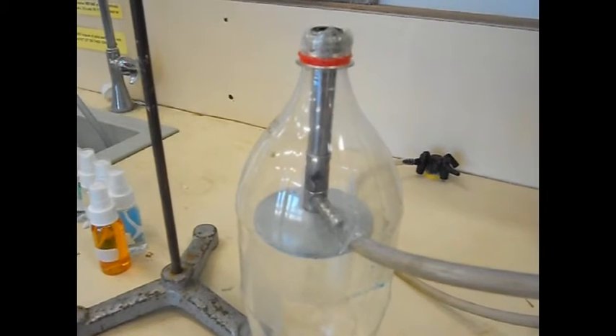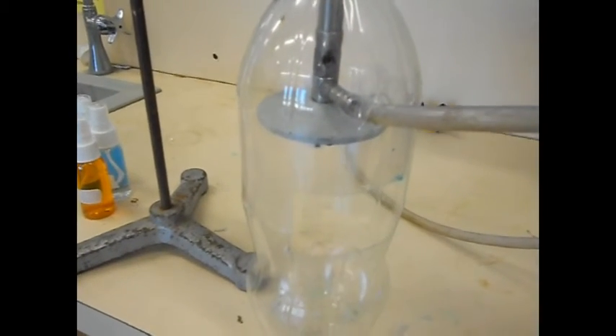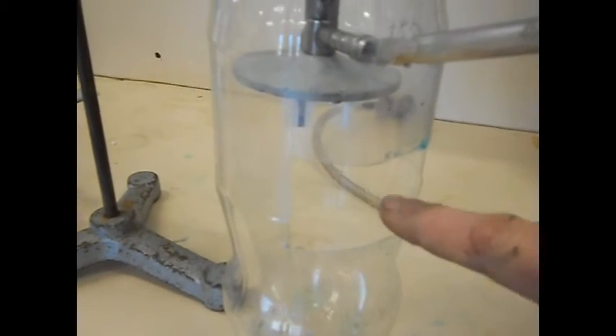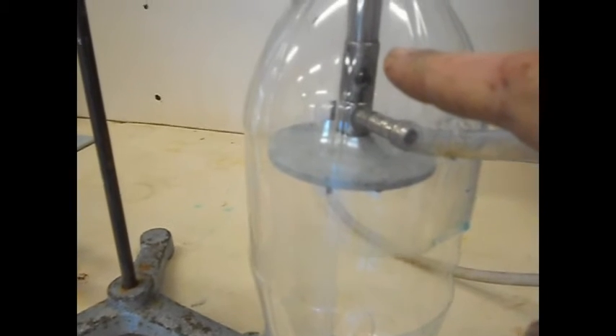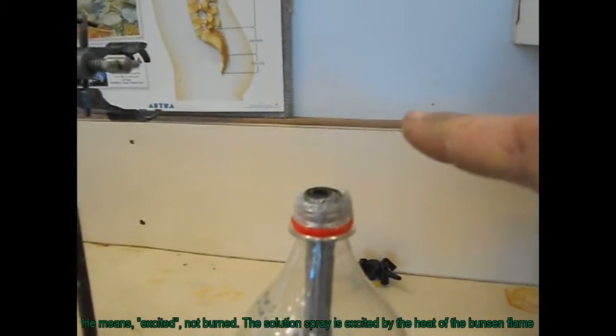The idea here is that the Bunsen burner inside the 2-litre bottle has got a hole cut in it, so that the spray can be sprayed in here, will get caught up and go through the Venturi of the Bunsen burner, and then be burned up here, where we will detect it with the spectroscope.